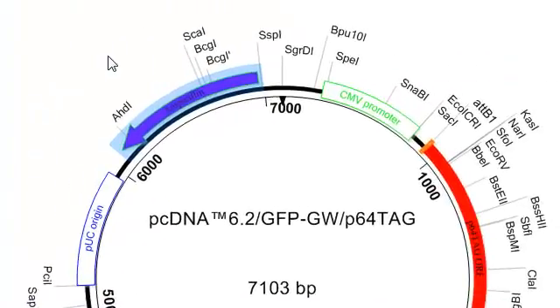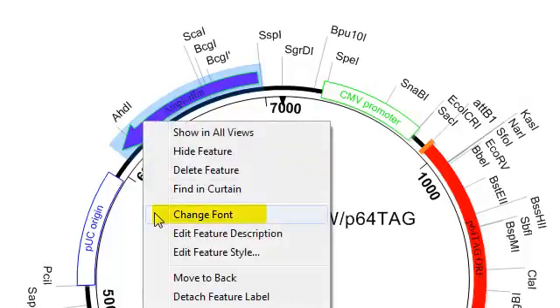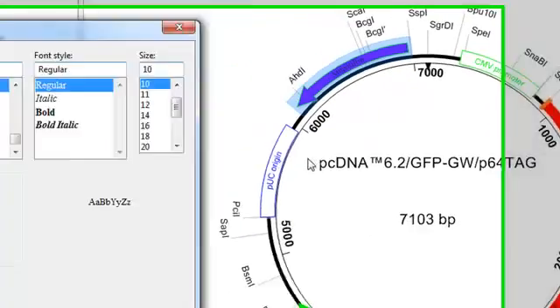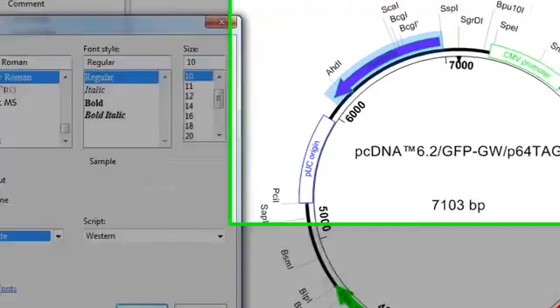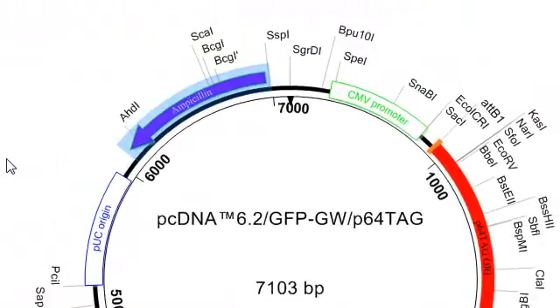And you can see that that change was made, but now the label is a little difficult to read. So, if I right-click on the feature and select Change Font, now I can change the font color to white, and that will make it easier to see.